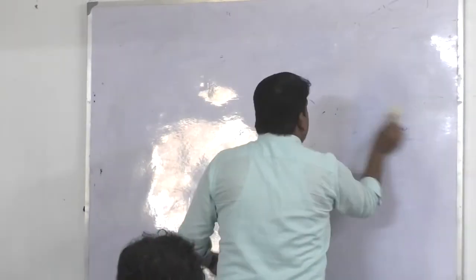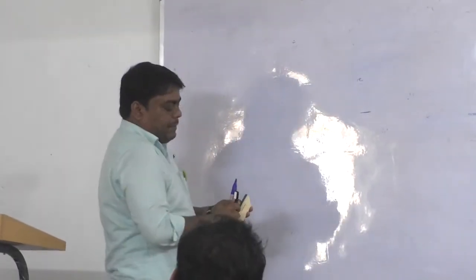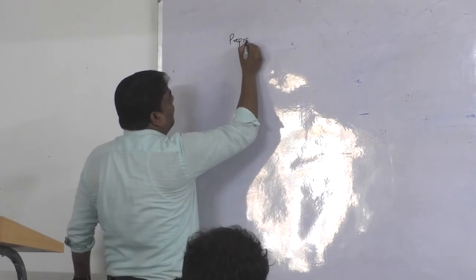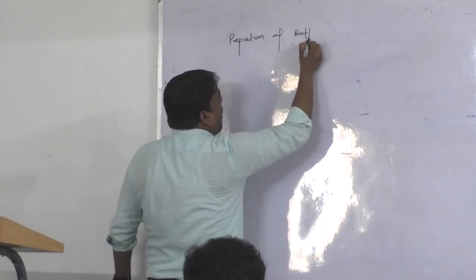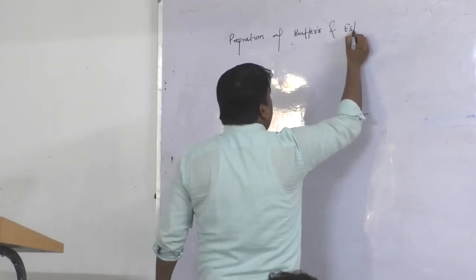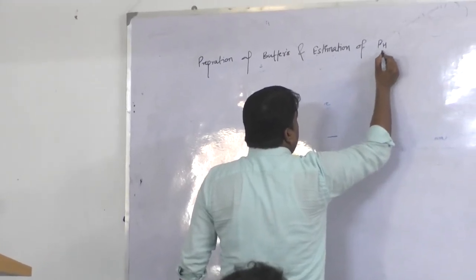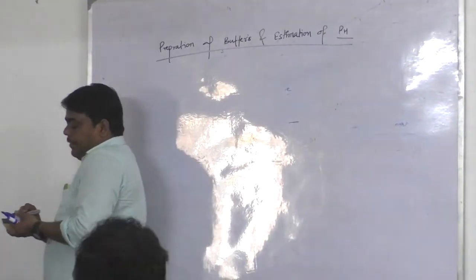the topic: Preparation of buffers and estimation of pH. Preparation of buffers and estimation of pH.